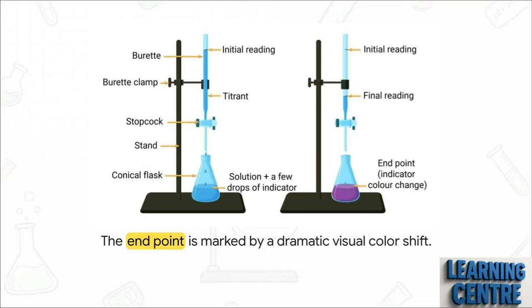Now, what's really interesting about this slide is that dramatic visual shift at the endpoint. This permanent color change is your literal aha moment. It's the chemical clue screaming at you that the reaction is done.